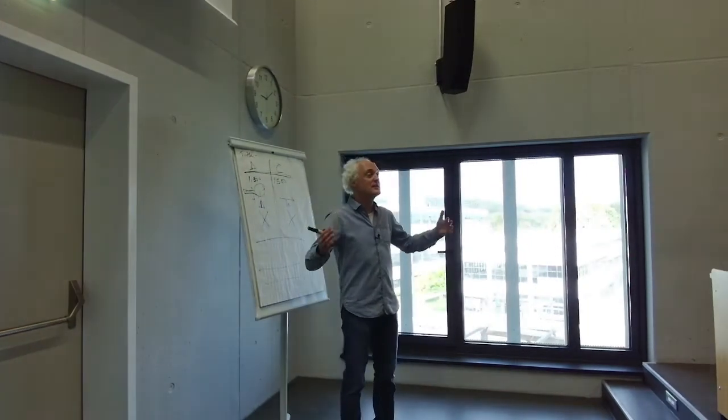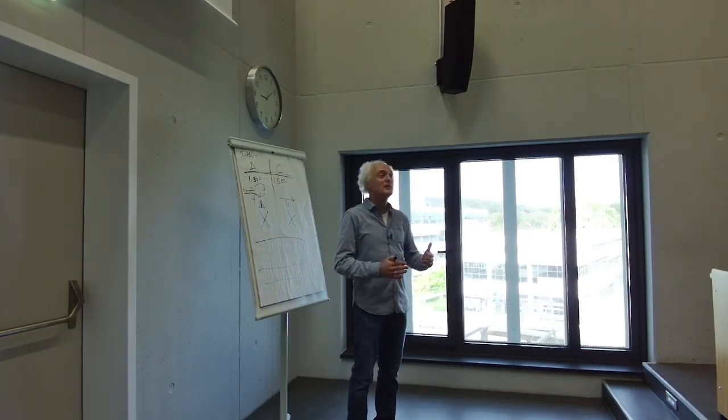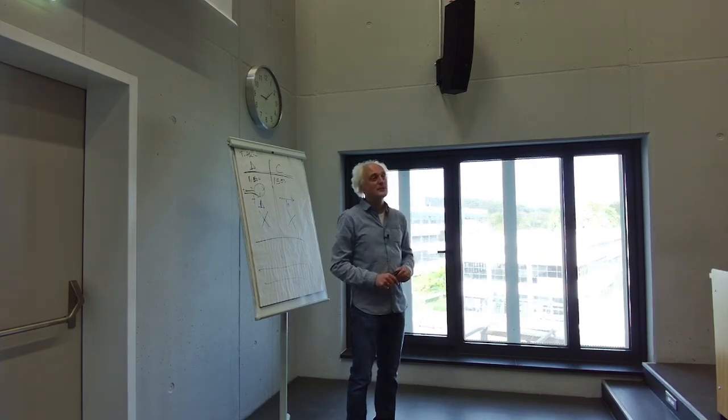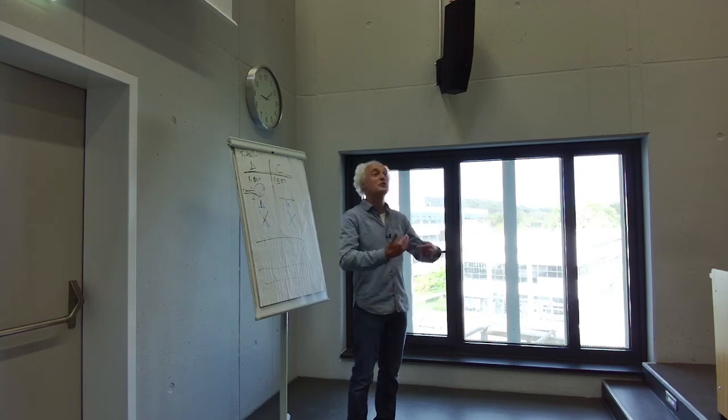Because our intention is we want to estimate a feed rate. A feed rate which makes sense in our system, for example if you want to optimize your ethanol production for yeasts with glucose, and this is what you will do in your simulation experiments. So this is our starting point.